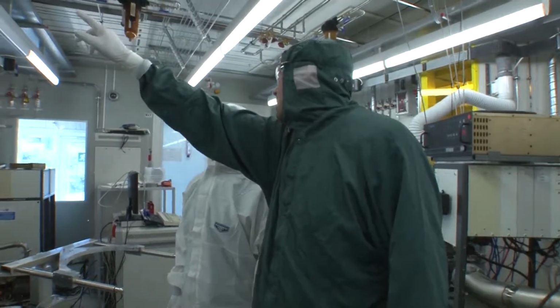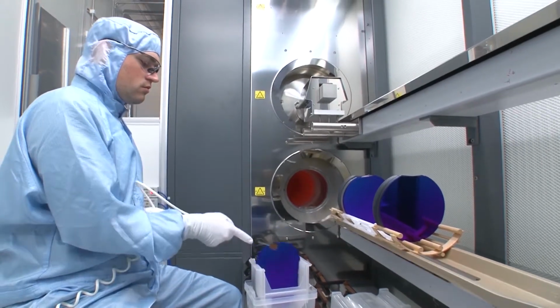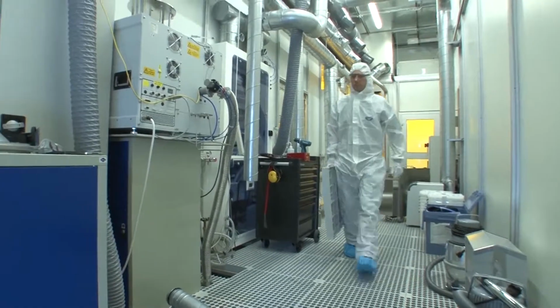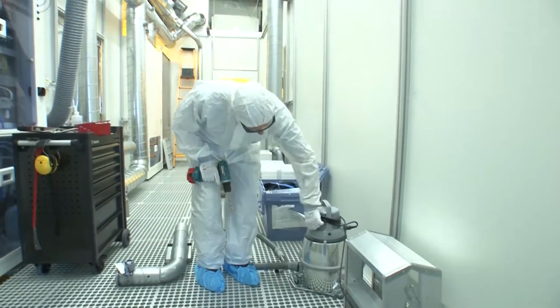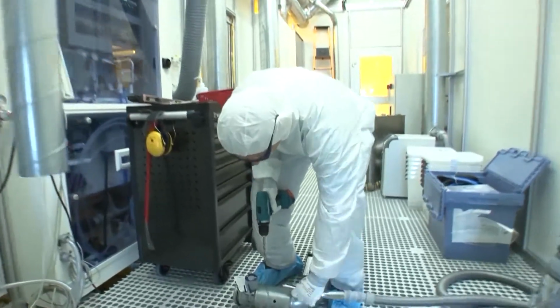Inside the clean room, we distinguish between the service rooms and the clean rooms where the work with wafers is done. You must only be in the clean room if you have work to do there. Take particular care if you come from a service room and maybe even have sat on the floor. You could risk bringing many particles in with you that can destroy the products. If you suspect that your suit has become contaminated, you must change it.